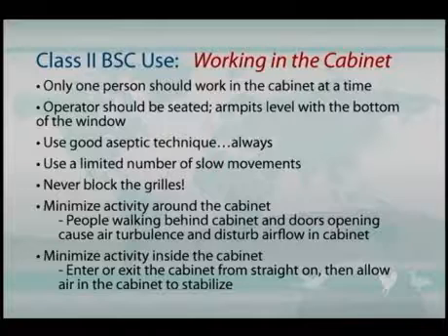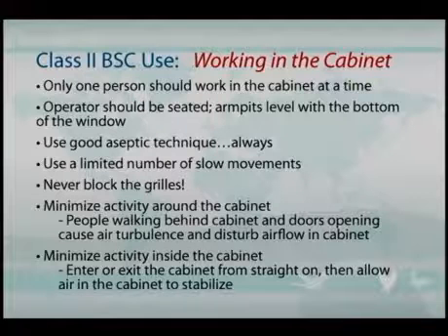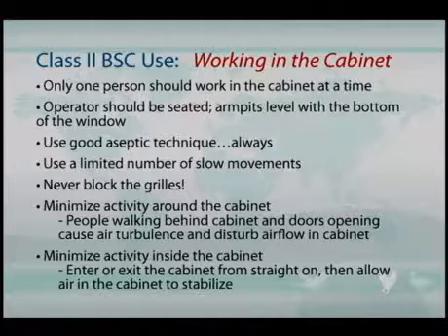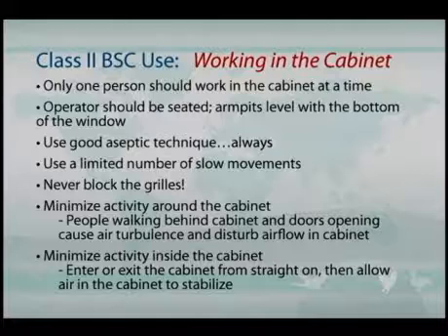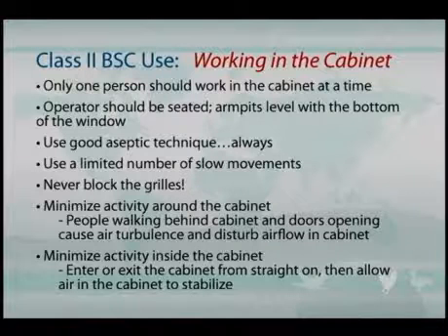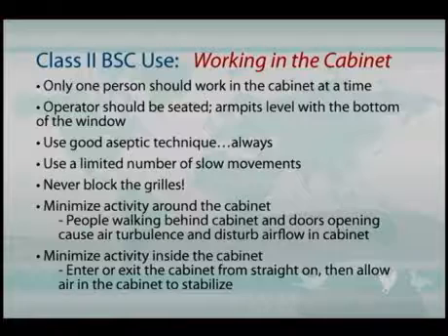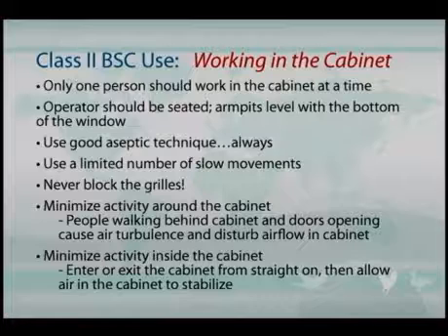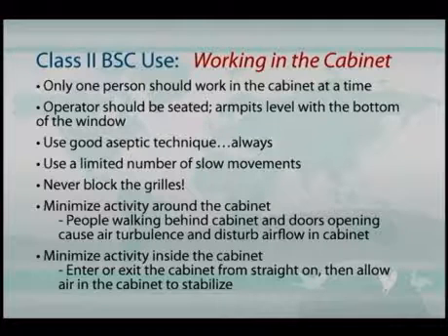Now, while working in the cabinet, we should also be aware that these cabinets should be placed in areas where there's not a lot of activity. A person walking behind the cabinet, for example, can cause a draft as they move swiftly behind the cabinet, and this air turbulence could allow air from inside the cabinet to be pulled outside of the cabinet. And of course, minimize the activity within the cabinet. Try to enter and exit the cabinet in straight lines to cause the least amount of air turbulence or disturbance.